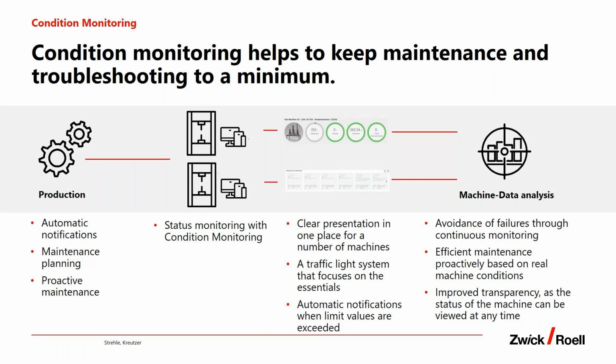For example, he can do a measurement again with this load cell. The load cell could be all right, or he can immediately change the load cell if it's necessary. But having this information, planning by time what's coming up next, is quite helpful for him.